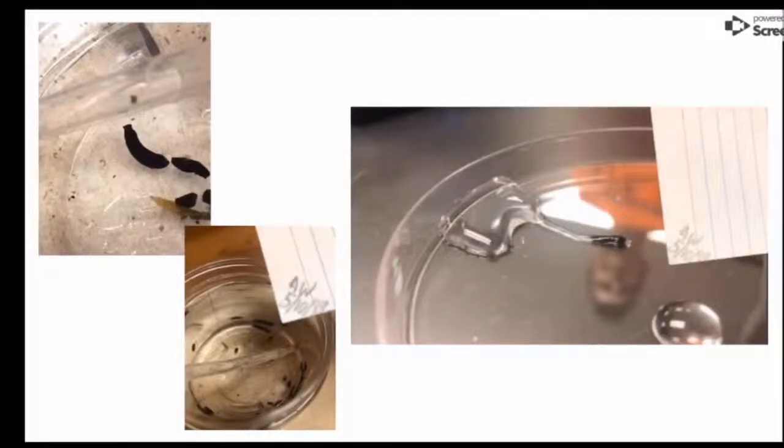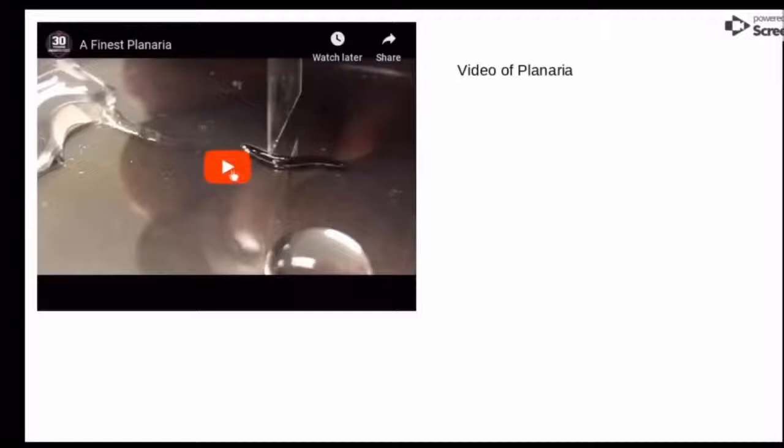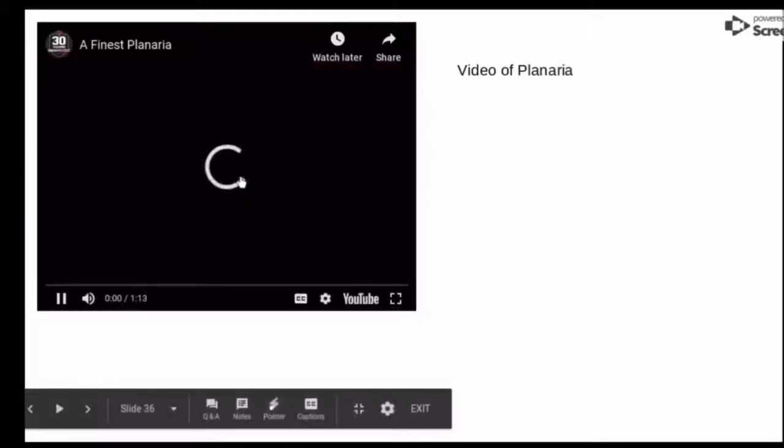Should we play the video on that? Yeah. We also took a video of the planaria being cut in half, so you can watch that here.